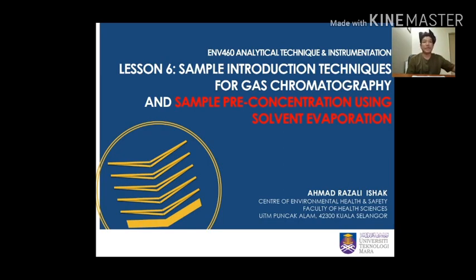In the previous lecture, we discussed a few topics of preparation of organic compounds in either solid form or liquid samples. Most of these techniques use organic solvent to extract and collect the analyte of interest. For example, we use dichloromethane, methanol, and hexane to extract and concentrate organic compounds such as polyaromatic hydrocarbons and pesticides from soil or water matrices. After the extraction, the sample will be introduced into GC or HPLC through liquid injection. So the final sample is in liquid form.